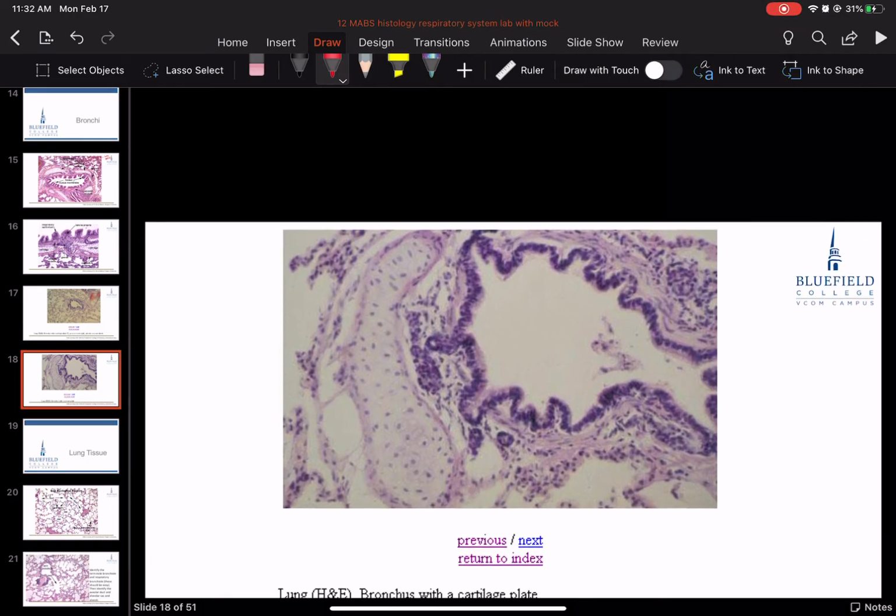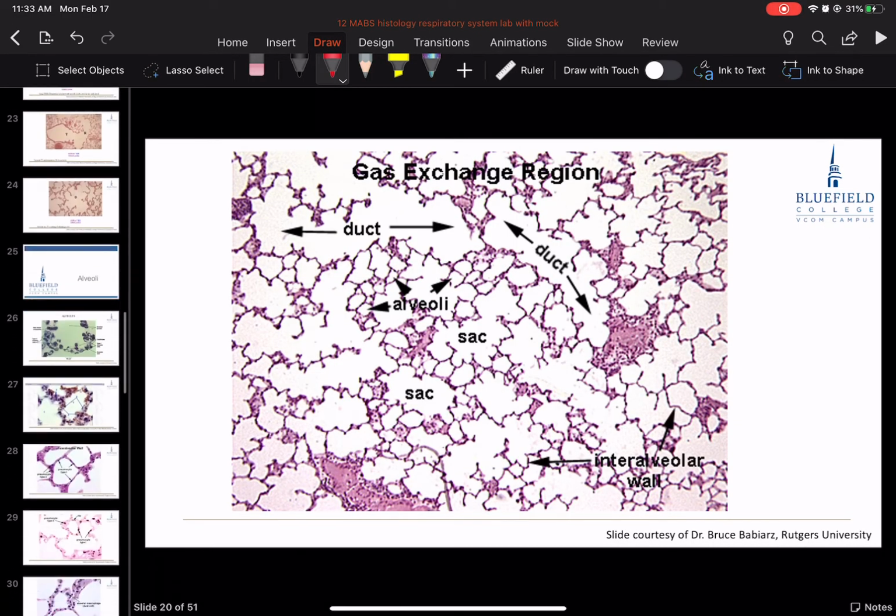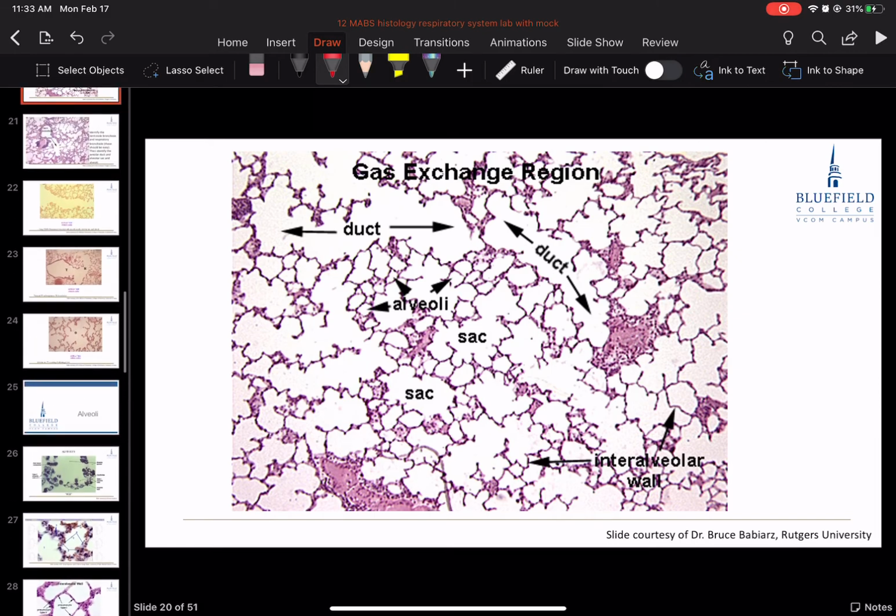All right, now when we get down further into the lungs, this is older than 8 years old. How do I know? Because look how thin that tissue has now gotten. You've got maximum number of alveoli at this stage. And so you see tons of alveoli. You've got some long hallways here where it's all thin epithelium. That tells me I'm looking at an alveolar duct.